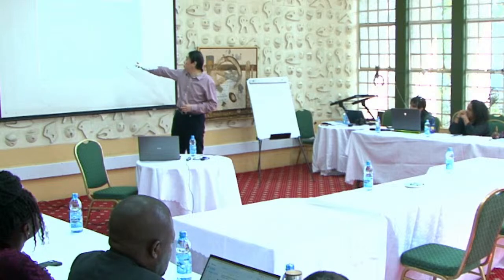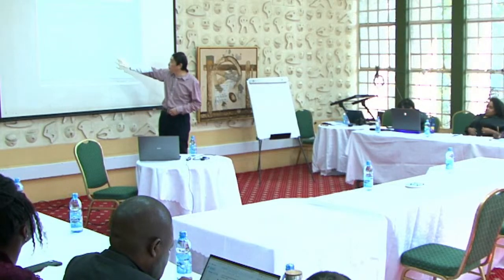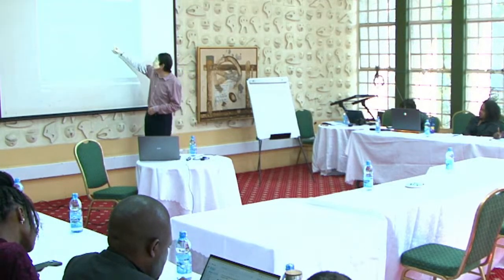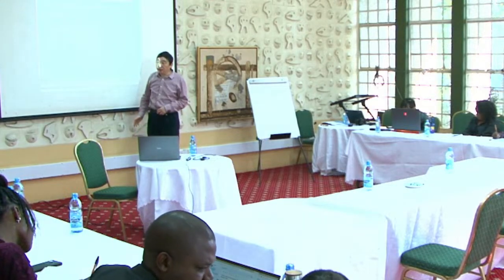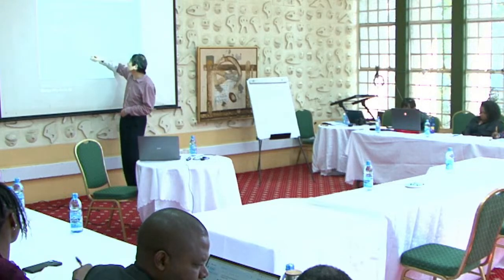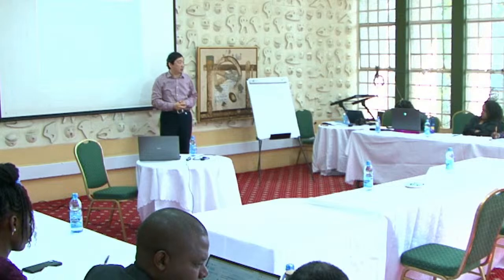So basically, when you propose a structure, you do it again to fragmentation. And also, as we said, you immediately have a few of them that fit to this one, then you see which one is the best. Like the 41 here, of course, the 41 you break from here can also be 41. But that 41 probably does not look this strong.